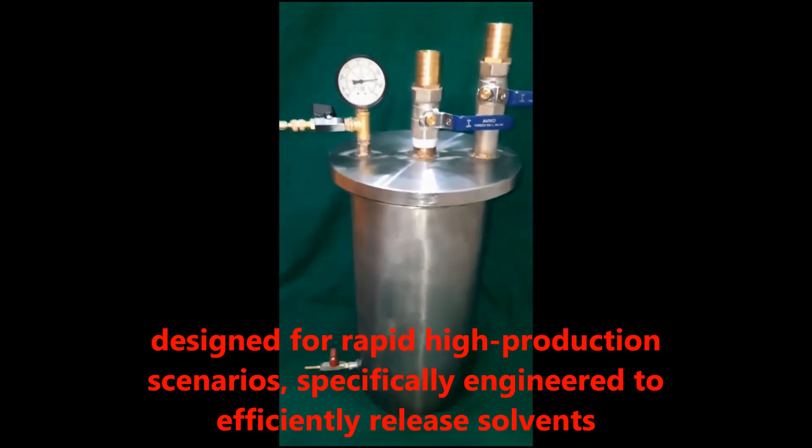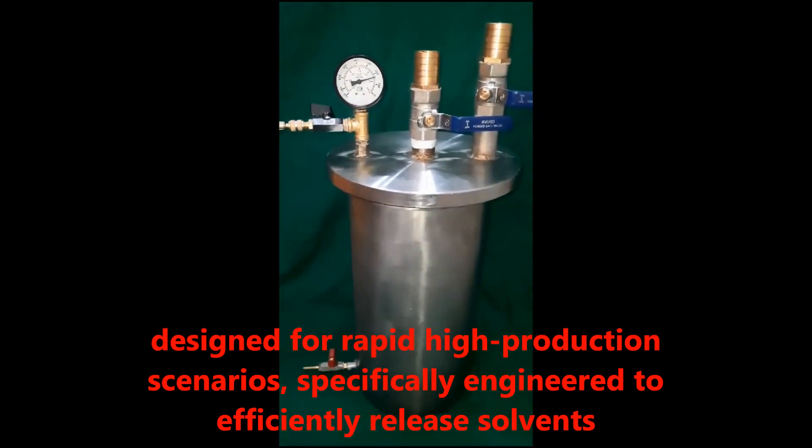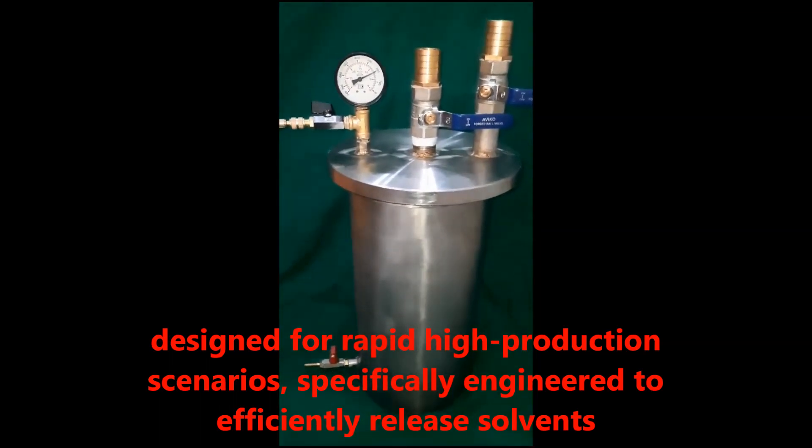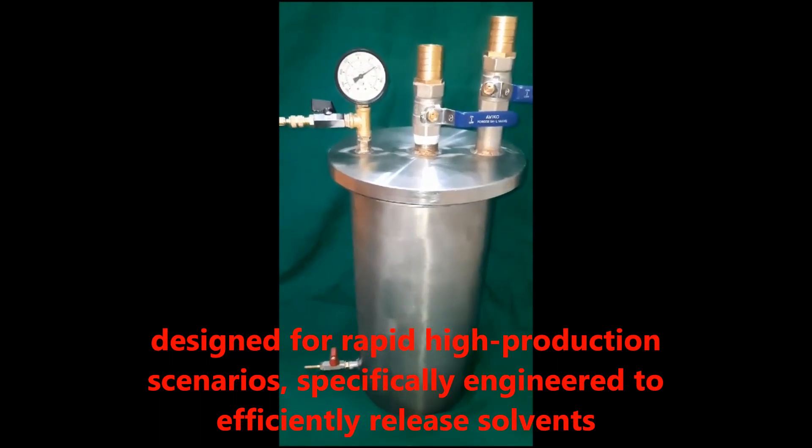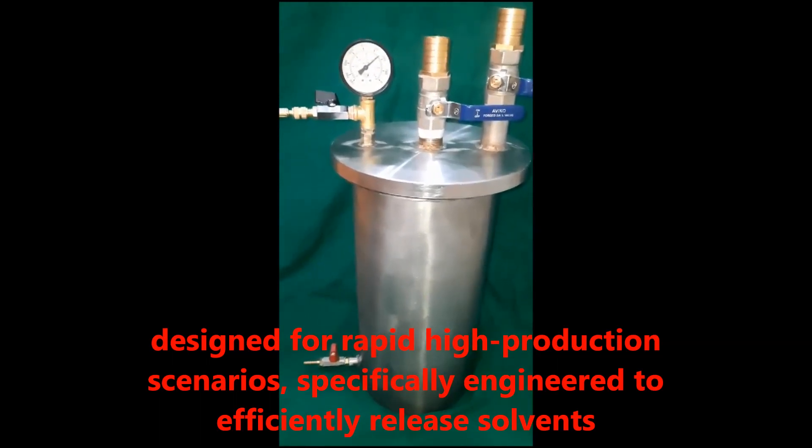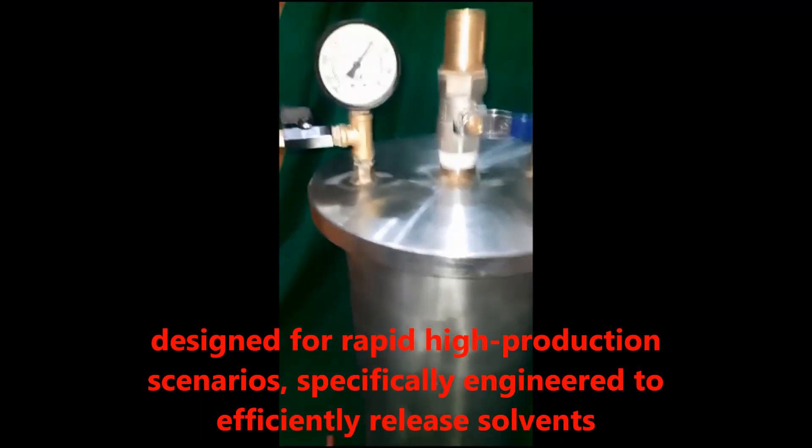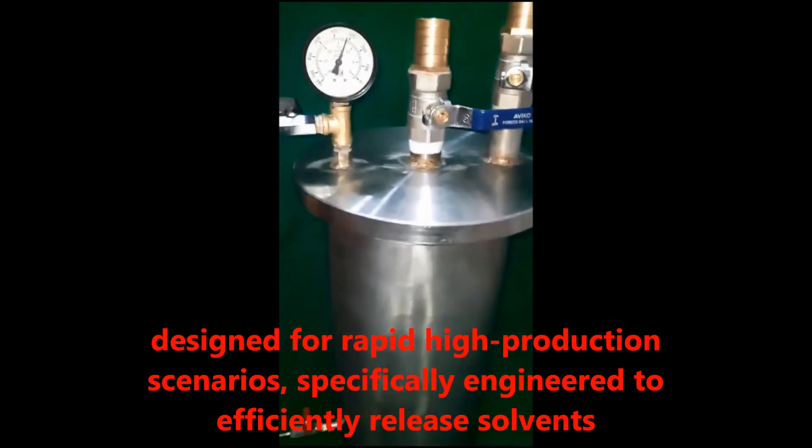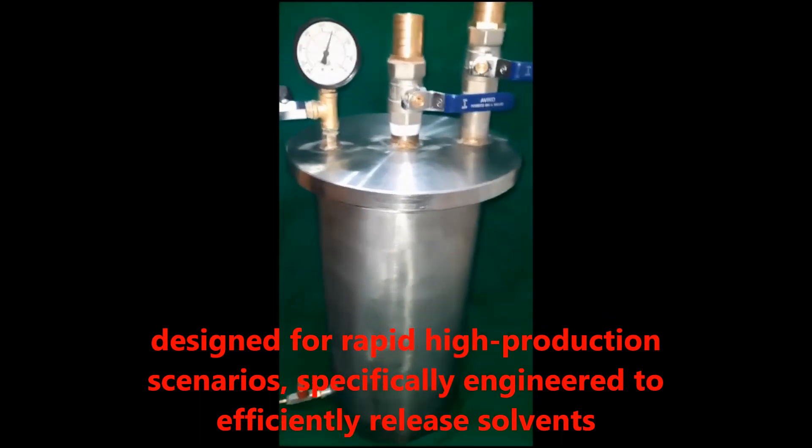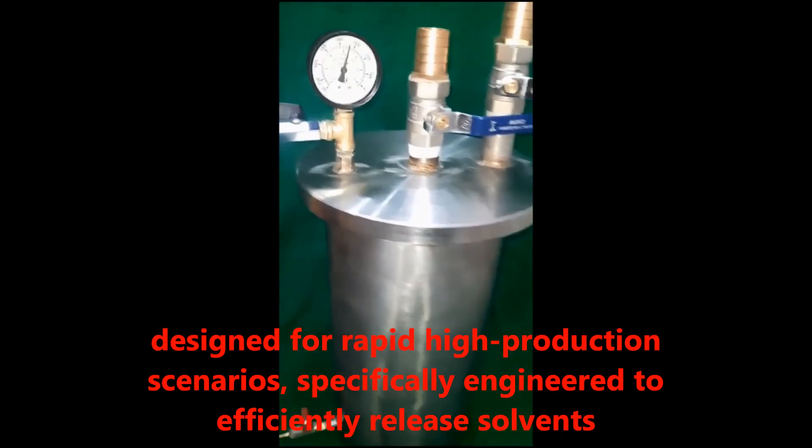The outer chamber is equipped with substantial 1-inch BSP inlet and outlet ports, facilitating efficient coolant circulation for liquids such as water, glycol, liquid nitrogen, and liquid carbon dioxide. This trap stands out for its ability to handle gases even at exceptionally low temperatures.